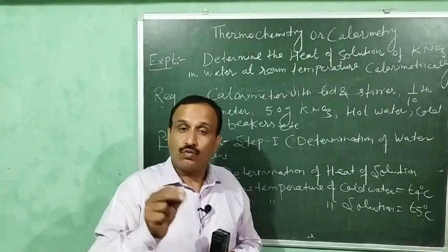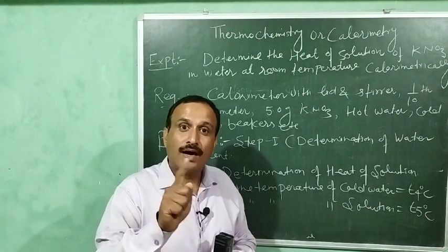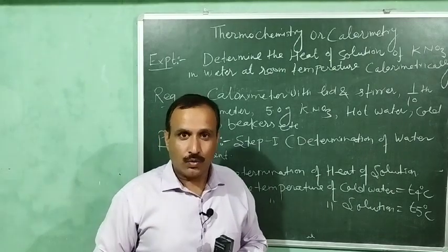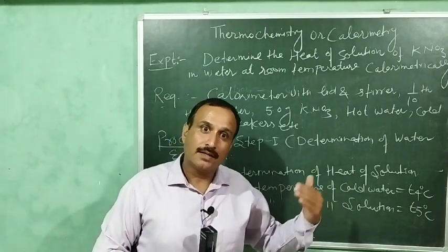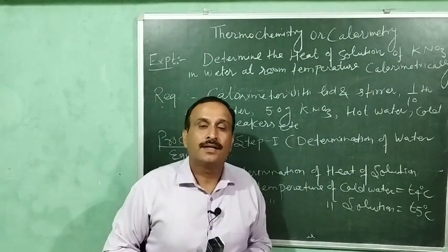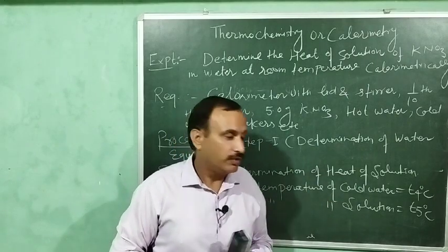लेकिन हम स्टॉप वॉच को बंद नहीं किए हैं पहले, तो जो सॉल्यूशन की पहली रीडिंग आएगी टेम्परेचर की वो आएगी आफ्टर 6 मिनट्स, फिर 7, 8, 9 and 10. Okay, so in this way we will note the temperature of cold water for the 5 minutes, then the temperature of the solution for the 5 minutes, and then we will plot a graph between the temperature and time as I explained in my previous video.